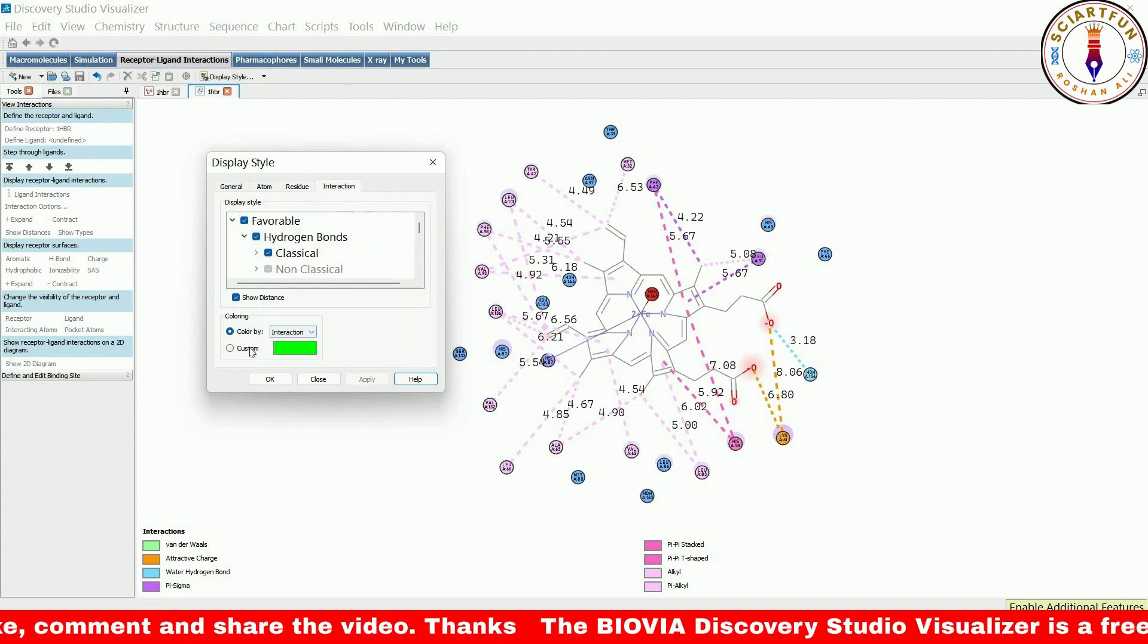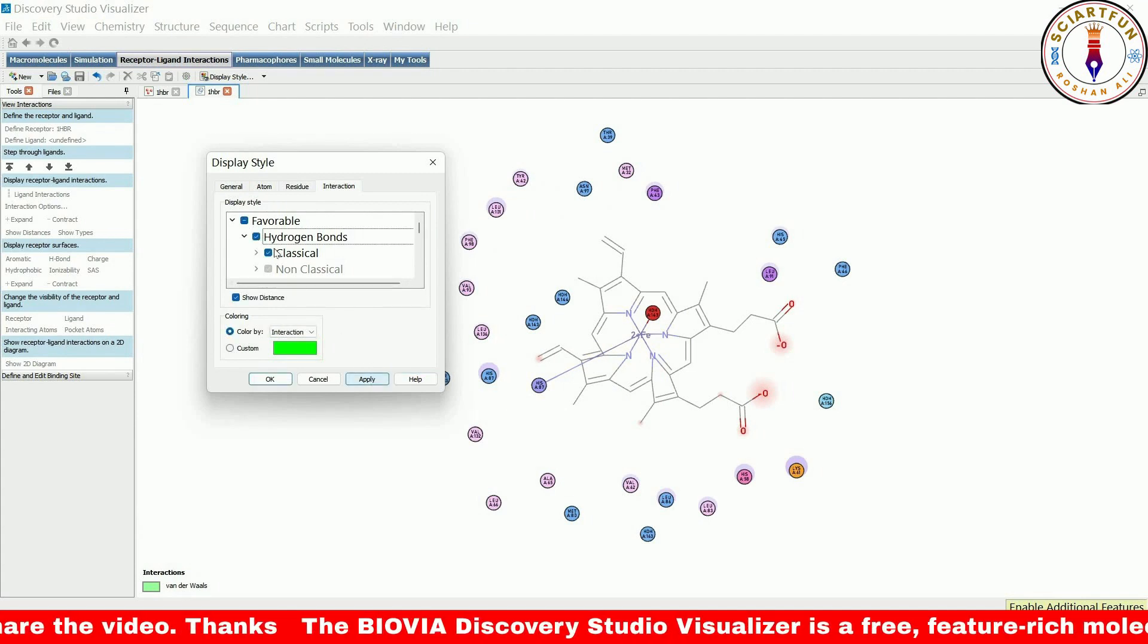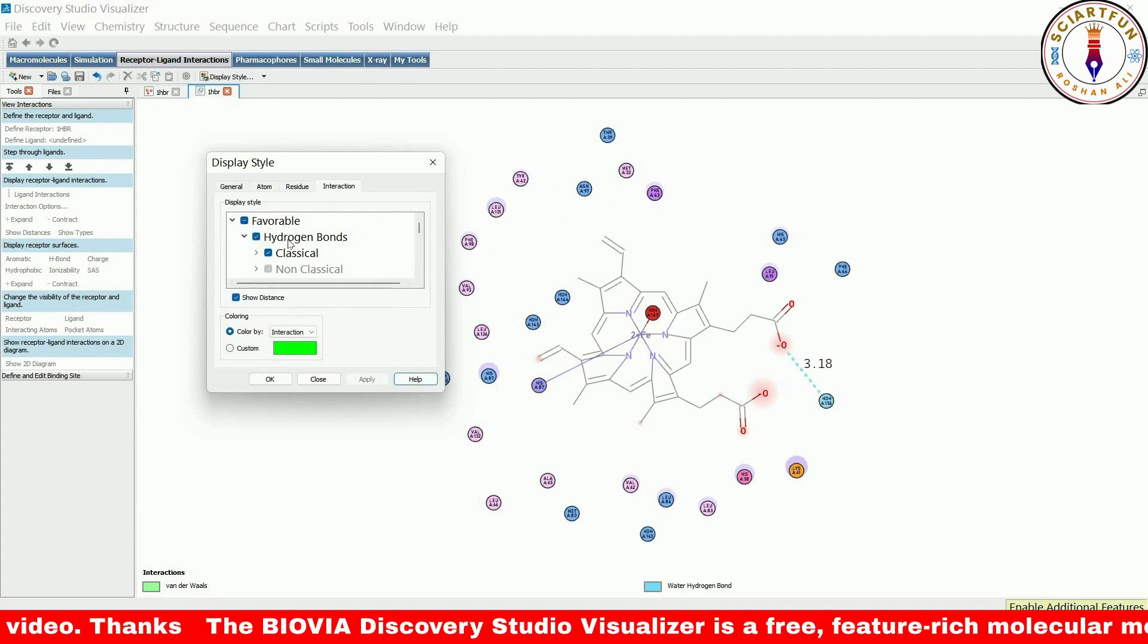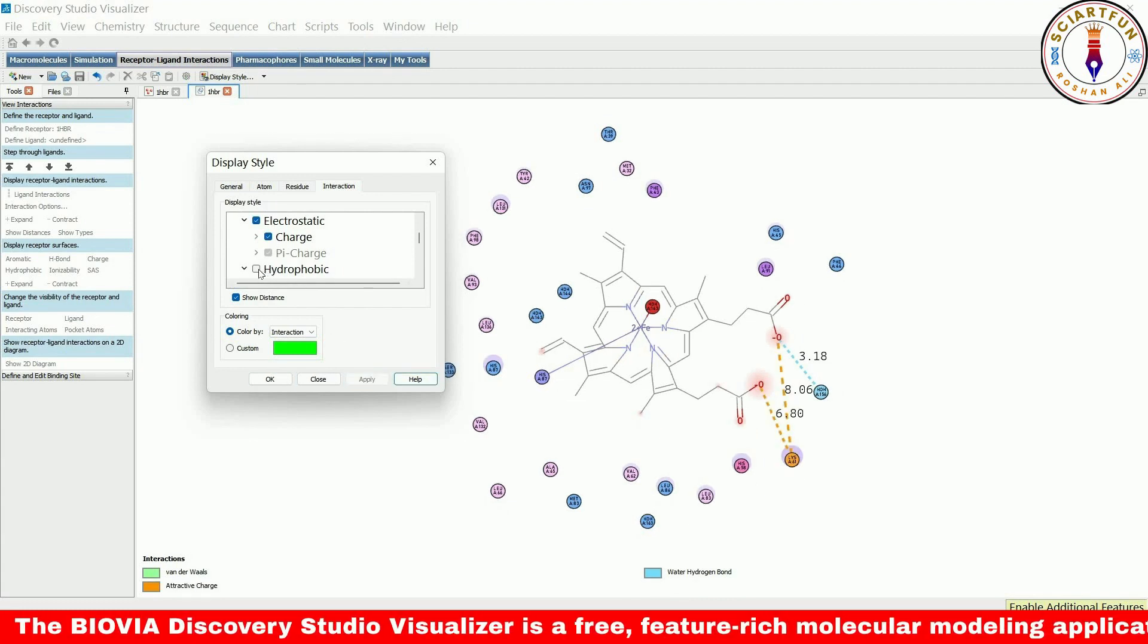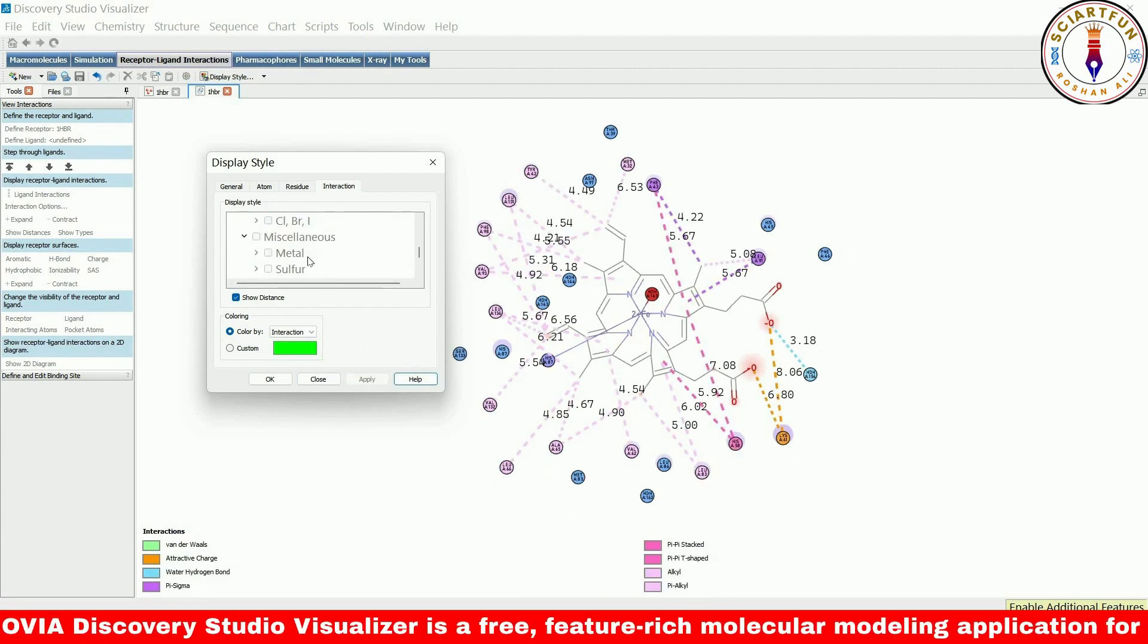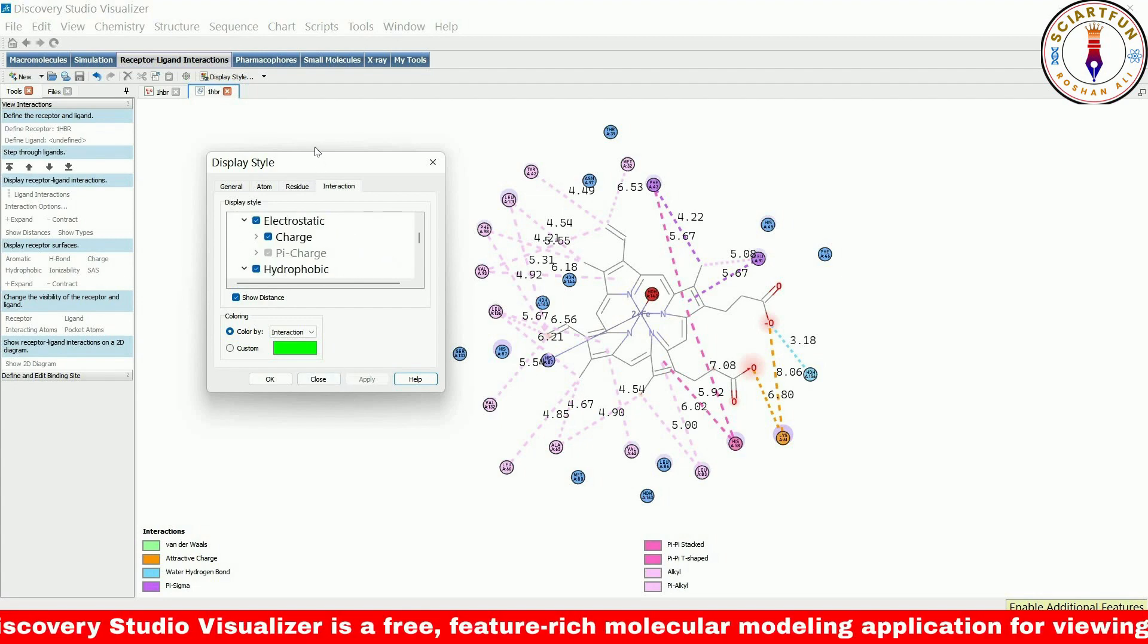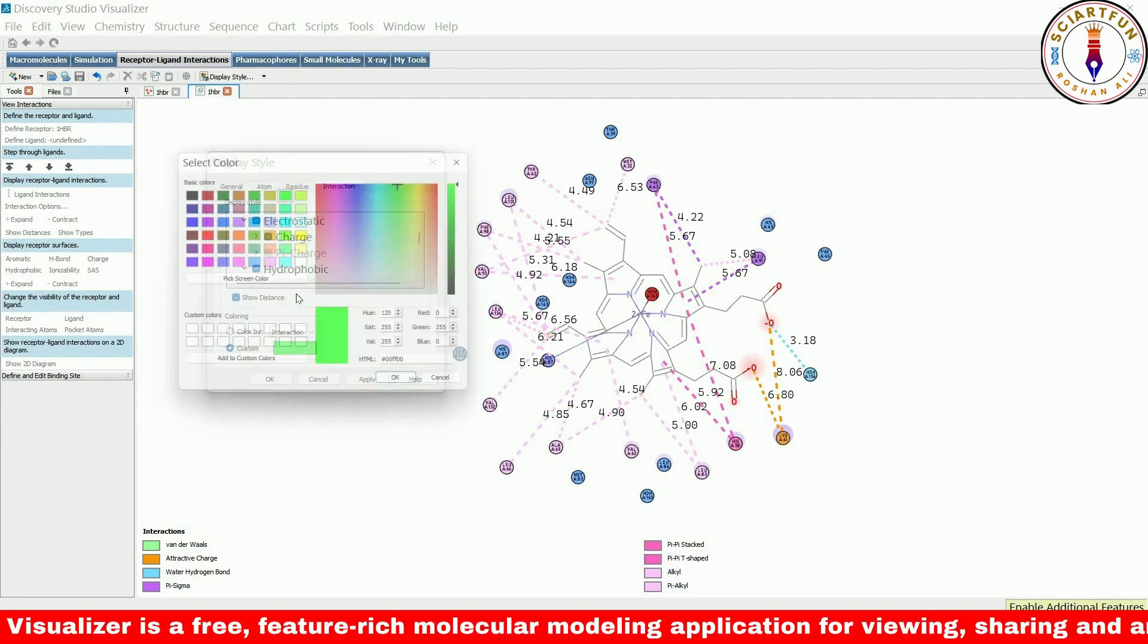In the interaction tab, we can control the appearance of the interactions. We have options to make them visible or hide them. We can also control the color of the interactions and make them all the same color.